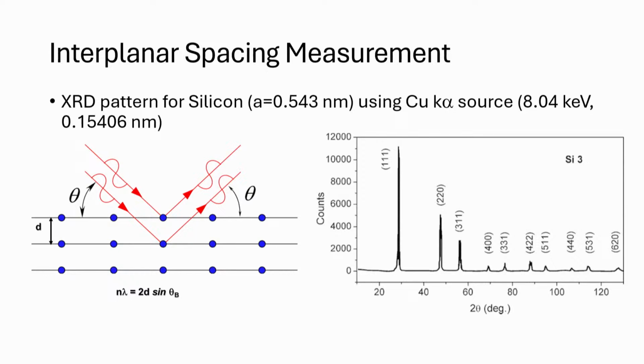Most X-ray diffraction software is smart enough to look at where the peaks are identified and then say, okay, this is going to be a silicon oxide, some kind of quartz sample or something like that, right? So the software will go in and tell you exactly what it is. And the reason they can do that is because they can define these peaks. These peaks are pretty sharply defined. You can come in exactly in your data and you can determine what the angle of diffraction is. So 29.2 degrees or whatever, you can do it within fractions of a degree. Plug it back into the equation, calculate the d-spacing.